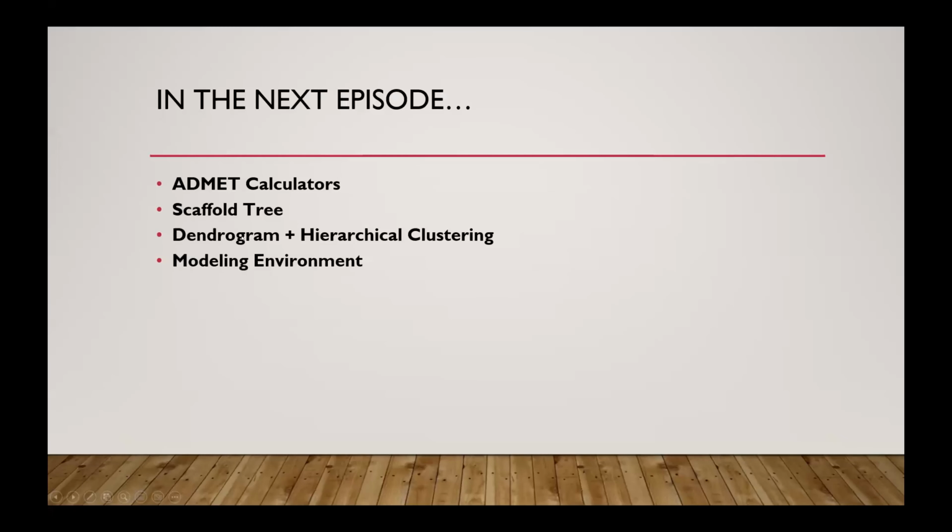So this is what's coming. Also, what we are planning to discuss is we have the ability to cluster the data using hierarchical clustering and visualize it in a dendrogram connected to a spreadsheet. So that's also a very convenient way to analyze your data.